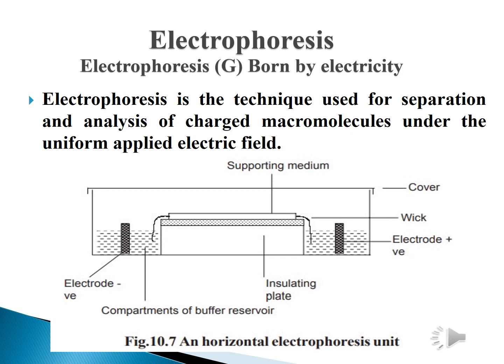There are so many methods available for separating a compound from a mixture in analytical biochemistry, but electrophoresis is the dominant one used for separating macromolecules. The basic principle involved in this method is that the particle for separation should be a charged one. For example, DNA, protein, etc.